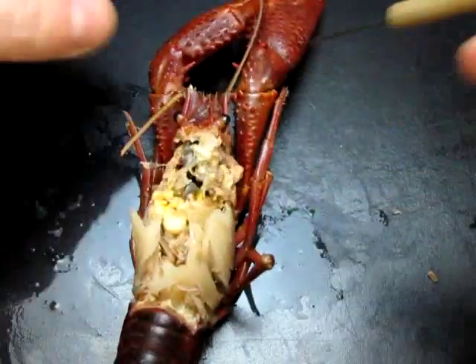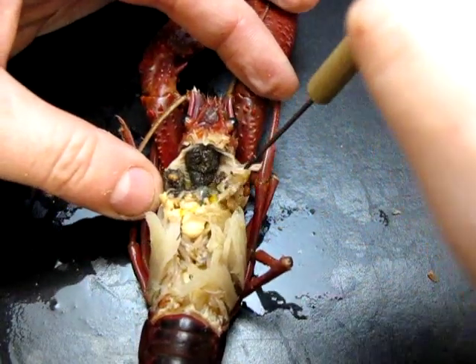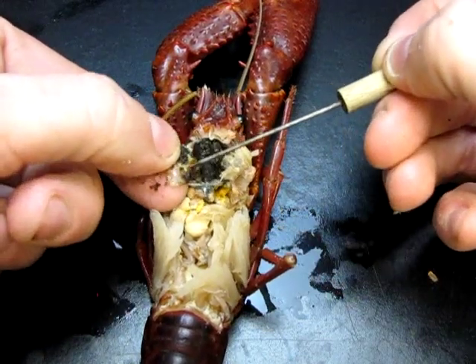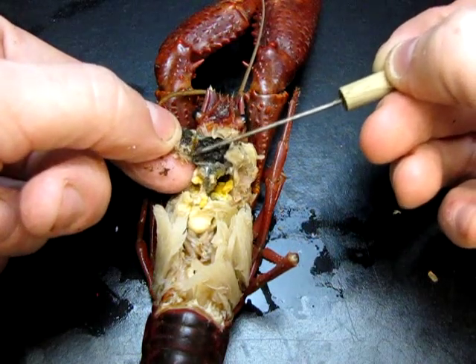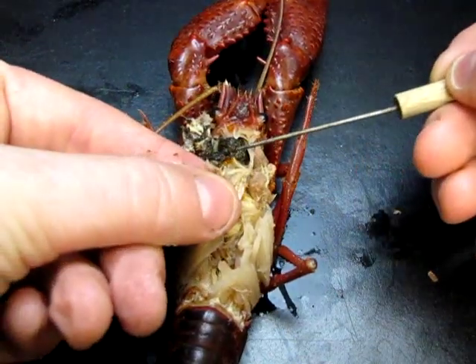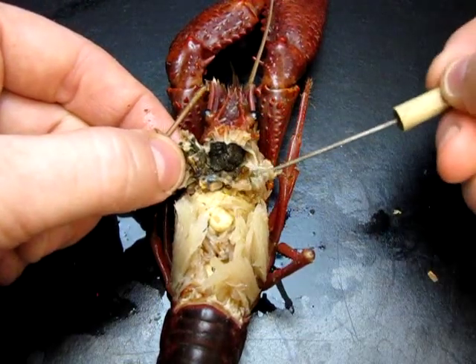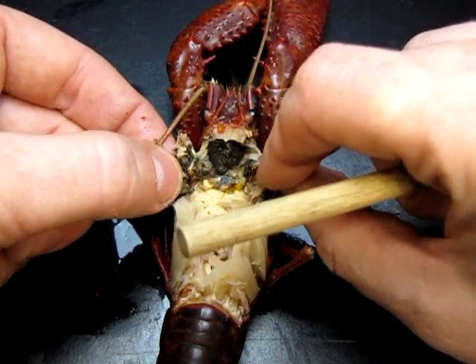I wanted to point out something interesting about the inside of the stomach. If you dig a little, you can see these pointy, tooth-like hard chitinous structures — one here and one on the other side. Those are called gastric teeth. They are contained inside the stomach and are involved in some mechanical digestion, so some grinding of food.